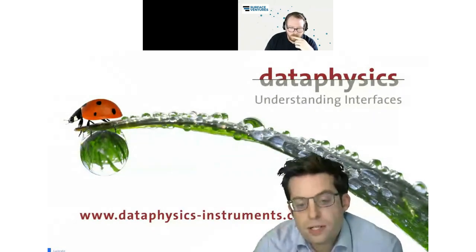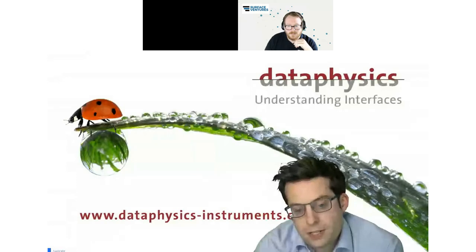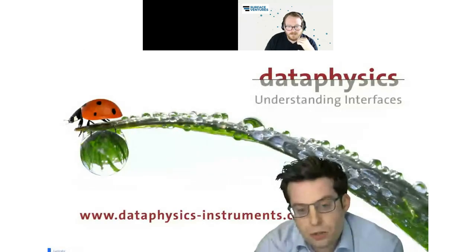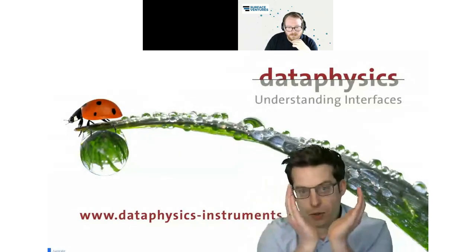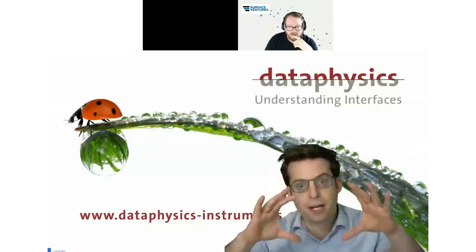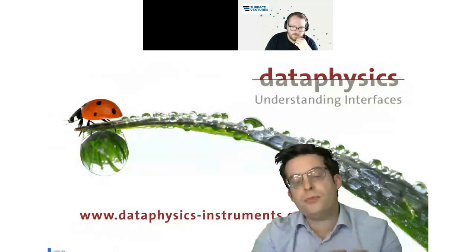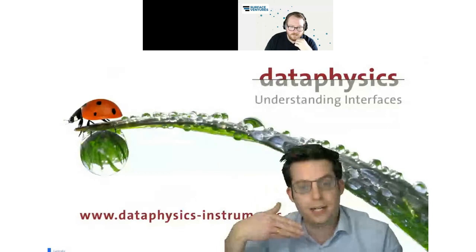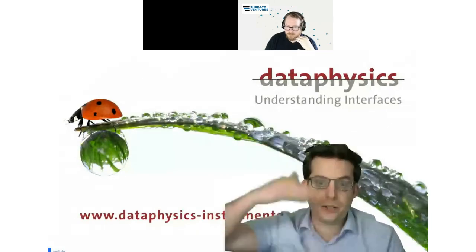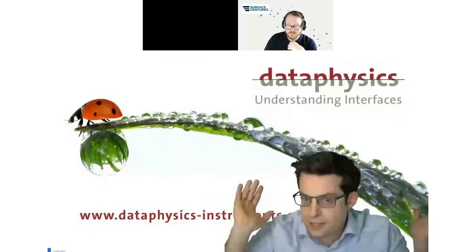So if the contact angle measurement for very high angle droplets is not accurate enough anymore, then I would practically go for adhesive force measurements, because they still show a very significant difference. Imagine going from 160 to 170 degrees and comparing the volume of the drop and the wetted area of the drop: there is a huge difference, and you can see this difference in the adhesive force. If you compare only the absolute contact angles, where the error can be plus or minus 2, then 170 and 175 are not meaningful anymore. They are basically the same within the error range.